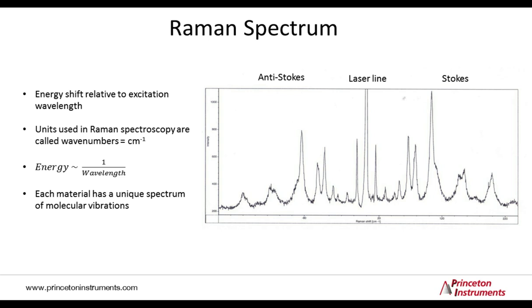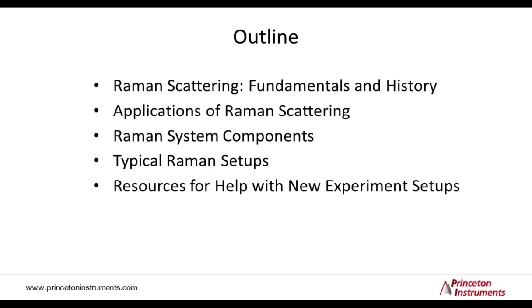But let's look first into some examples of how Raman spectroscopy is applied and some practical considerations for its implementation. So to do that, I will first, in the next section, talk about applications of Raman spectroscopy. And then we will discuss in a section the components of a Raman system, and finally show some common experimental setups.